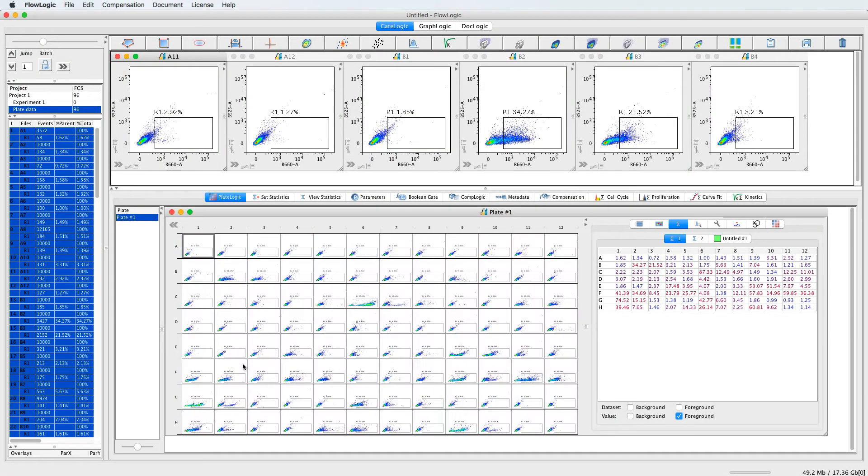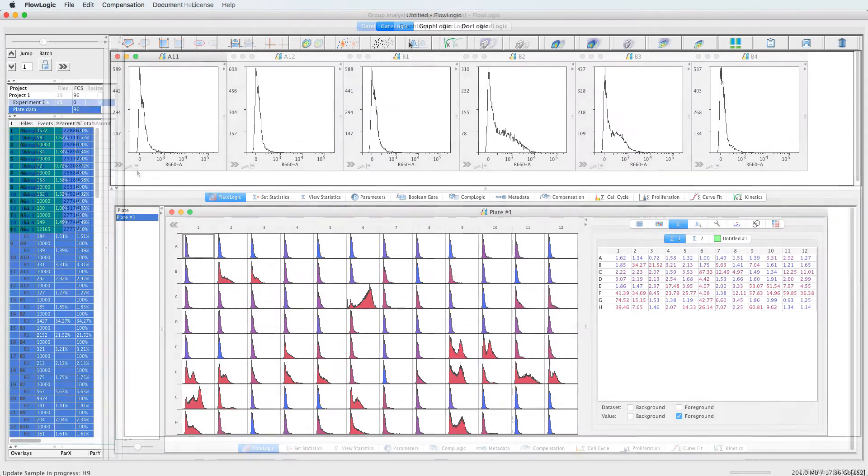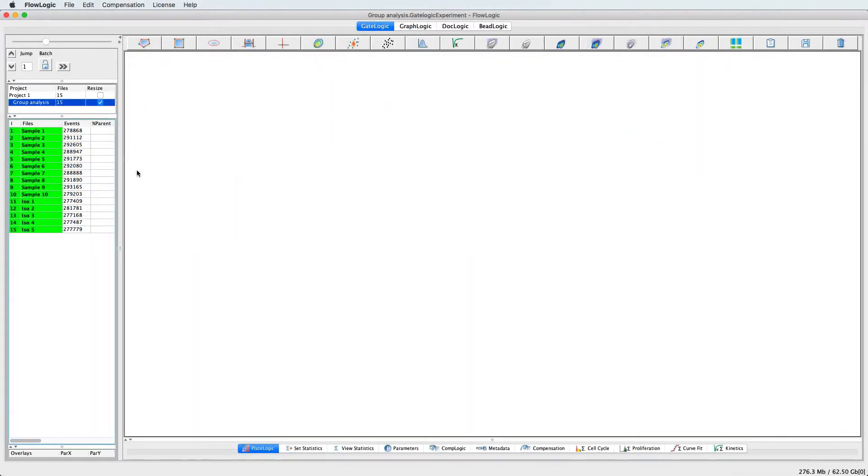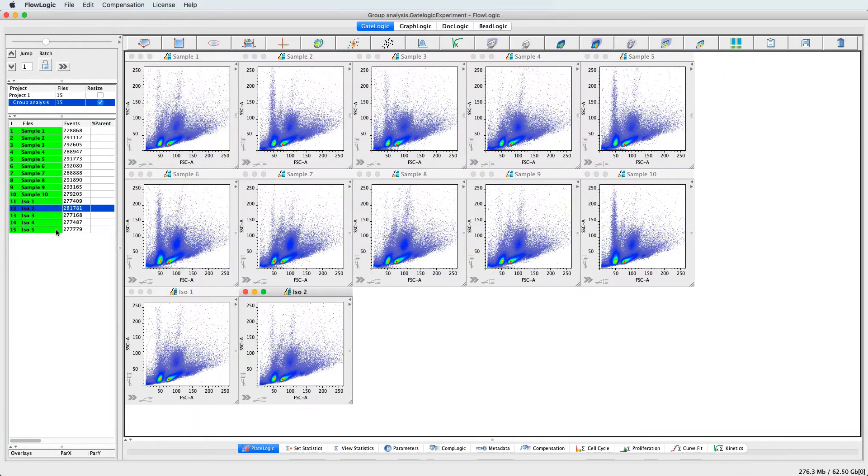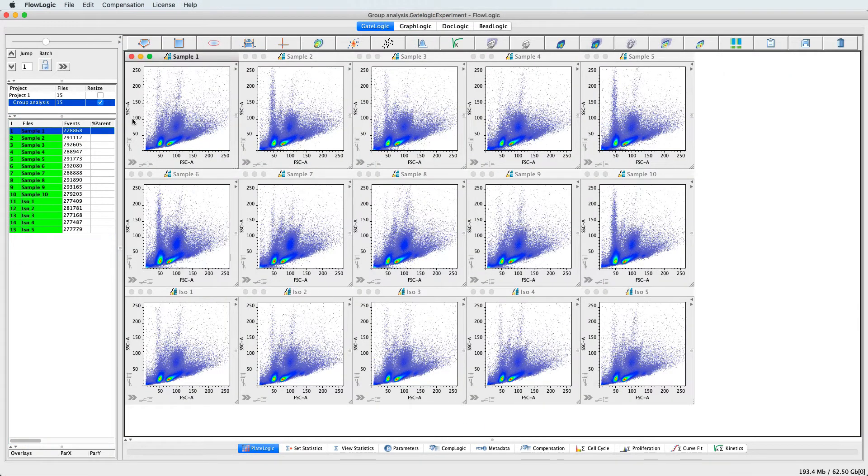visualize thousands of samples at once using automatic heat maps, or perform group analysis and watch all files update automatically.